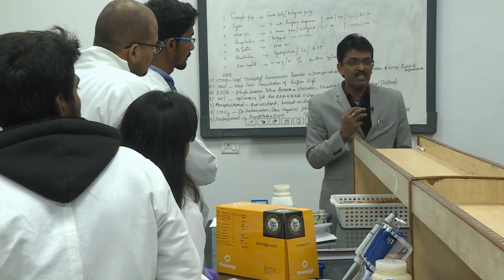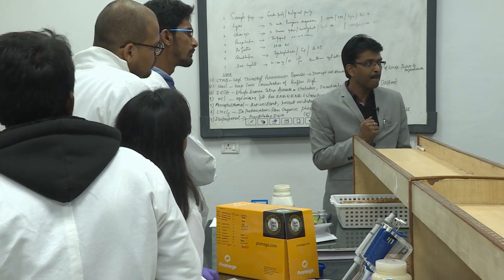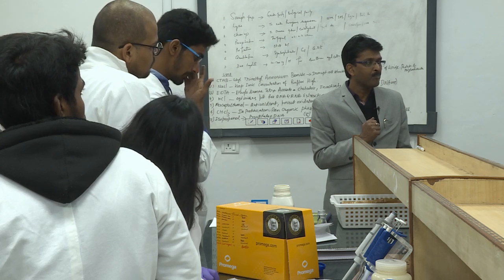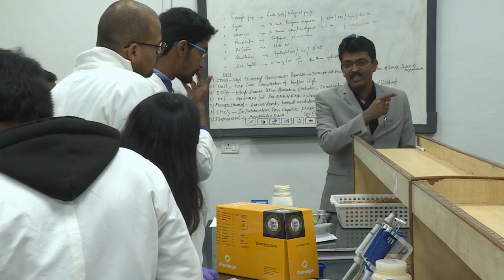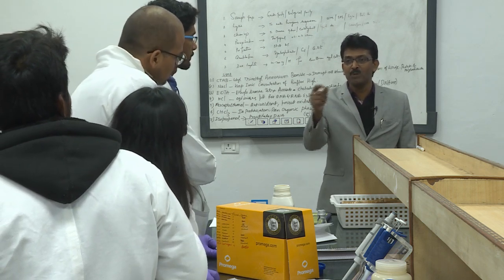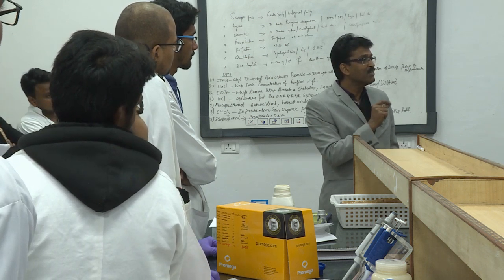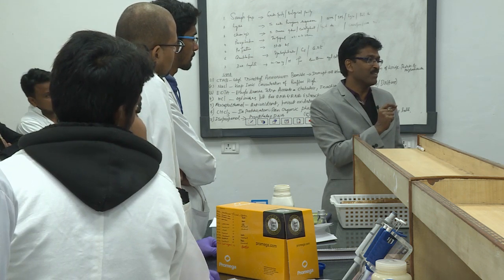Okay. So, any other quick questions? Whatever we quantify today does not remain constant when we quantify again the other day. So, what should be the probable reason? Yeah, it's a very good question she is asking. What is quantitated today is not there tomorrow. Okay. So, the reason is your DNA was not dissolved properly.